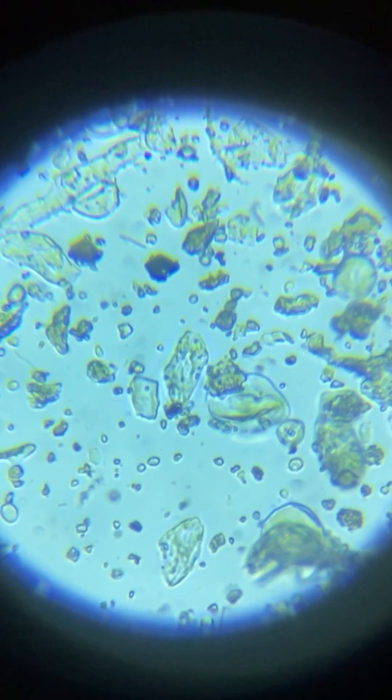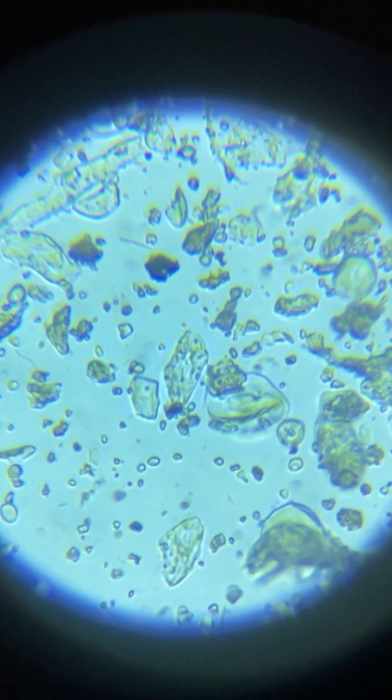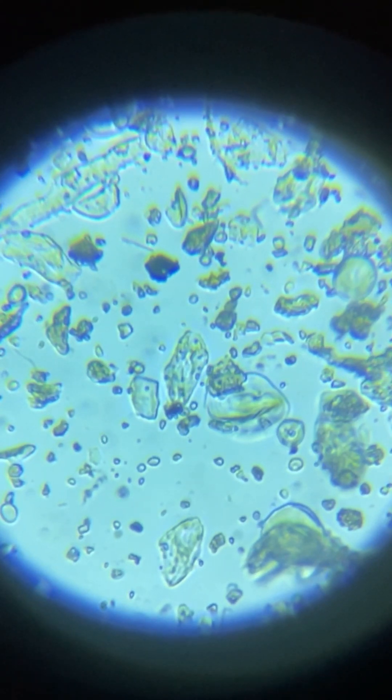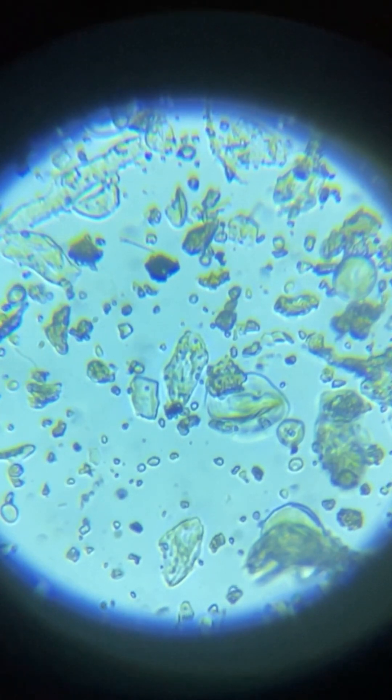Oh! You can see them moving! You see them moving — holy! You see them moving in the left corner? They're moving, really — they're so small, guys. They are so small but they're crawling. Let's see if I can get a closer look without losing them.